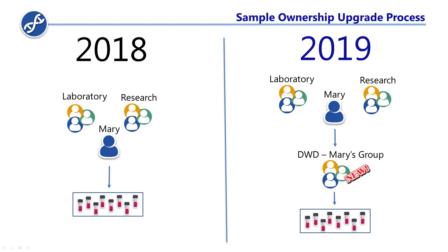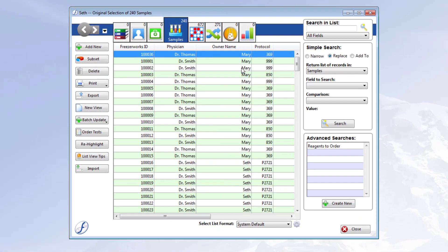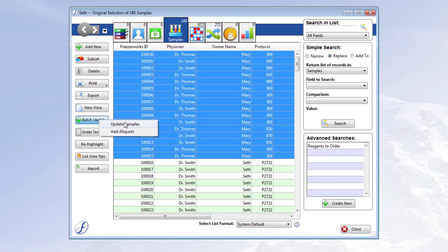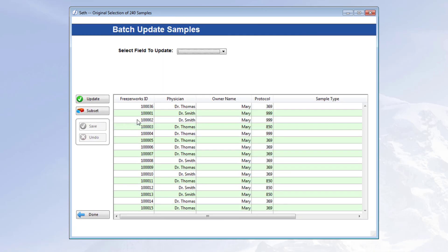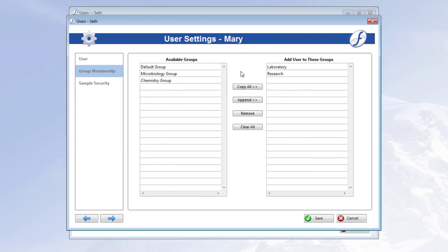This will only occur if the user who is a member of multiple groups also owns samples. So you can fix this in 2018 by reassigning ownership of the samples to users in a single group. With owner name on the list view, use batch update to do this quickly. Alternatively, you could remove the user from multiple groups, but this may not be ideal.